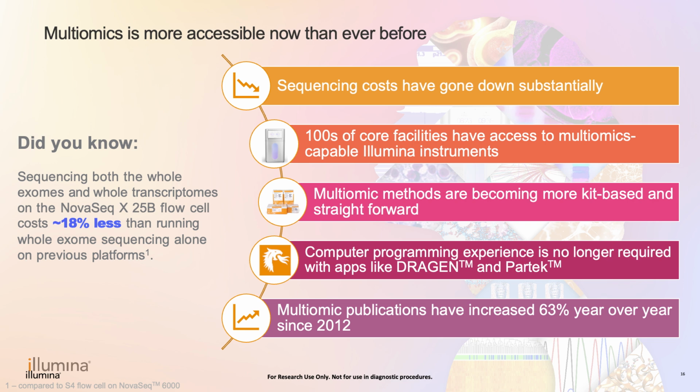And if you use the Advanced Genomics Core and you've noticed within the last year that your cost of sequencing has gone down, it's because of their investment into one of these instruments. It allows for greater accessibility to whole genome, whole exome, whole transcriptome, any omic, any sequencing, single cell, spatial, you name it, we can make it compatible with this instrument.